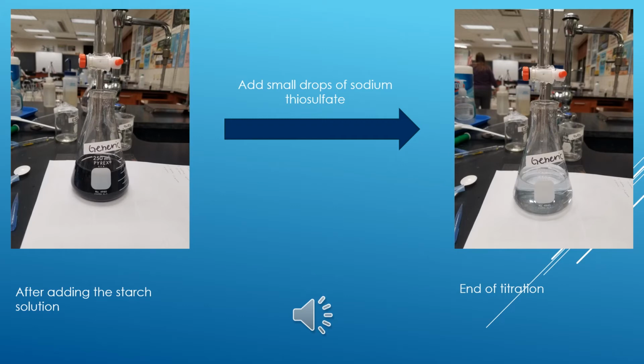I had to add this in small drops, one at a time, because the titration happened really quickly, and if you added one too many, it would have been too much. So you had to be very careful when it started changing and the blue started going away to stop adding sodium thiosulfate and just swirl it till it was clear.